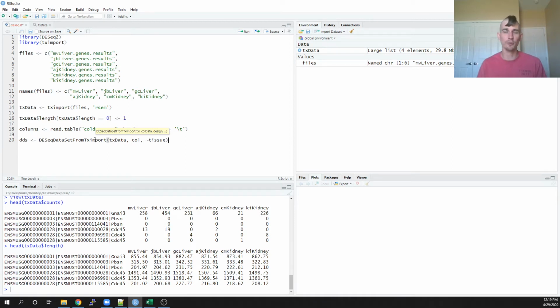I almost made y'all do that, but I got lost, and I was unsure if tximport was doing something more than just rounding numbers up or down. Turns out, yeah, that's all it's doing. I was worried it was doing more to account for gene length or something like that.